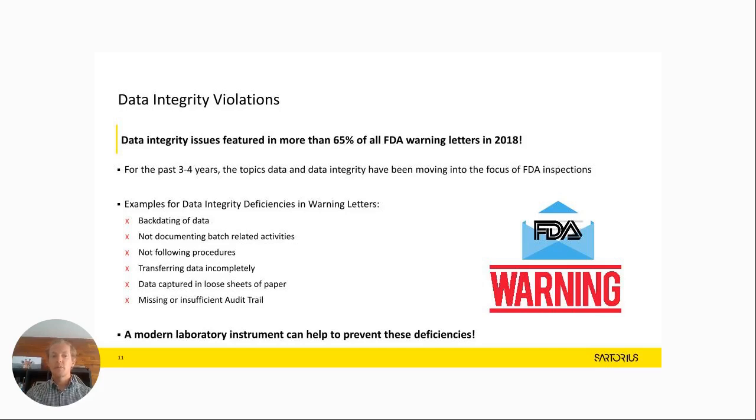The examples are backdating of data, not documenting the batch. That is something which I see very often internationally, not just in the US, but as well in Europe. Not following their own procedures. A lot of people have SOPs.